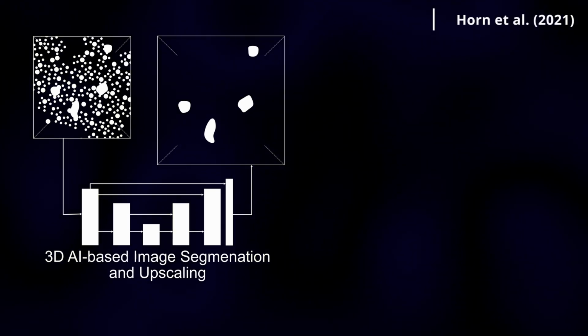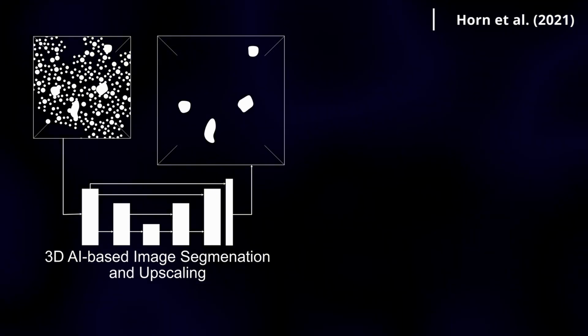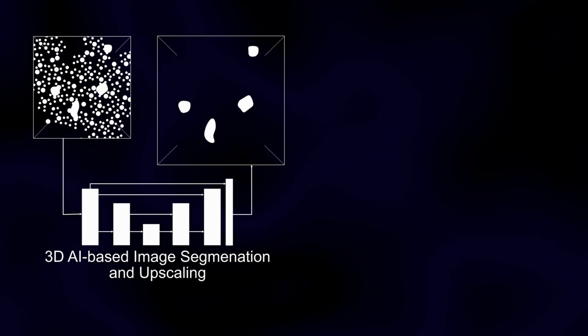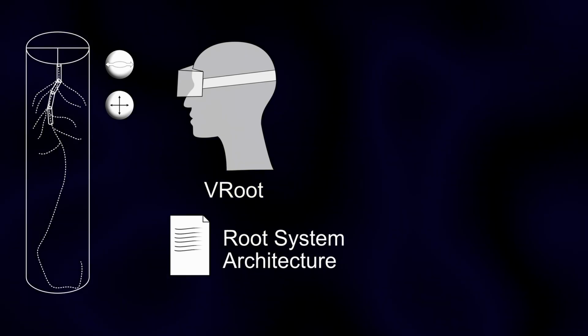This cleaner version of the data can be used by optimizers to find the tracing in the root system, but for these tracings to work, the globally optimal solution must also be the correct root architecture, which is not always the case. To mitigate this and to further increase extraction precision, we use virtual reality root tracing.